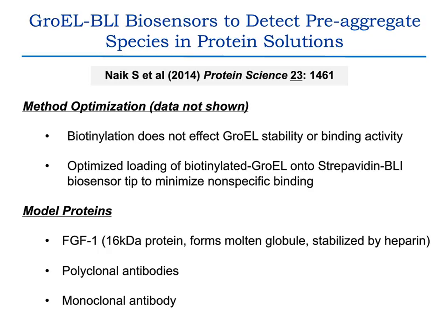The interesting thing about this as a control is that this is a protein well known to form molten globule states, or partially unfolded states, even under ambient conditions. And it's also greatly stabilized by the sulfated polysaccharide heparin. We also looked at some antibodies.